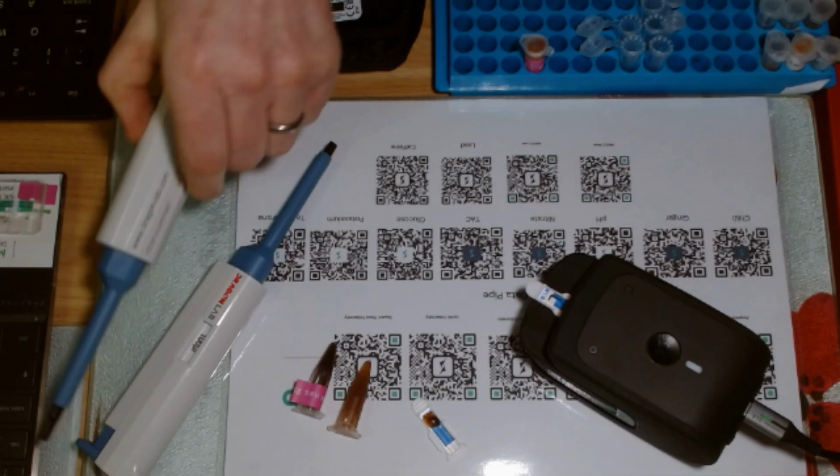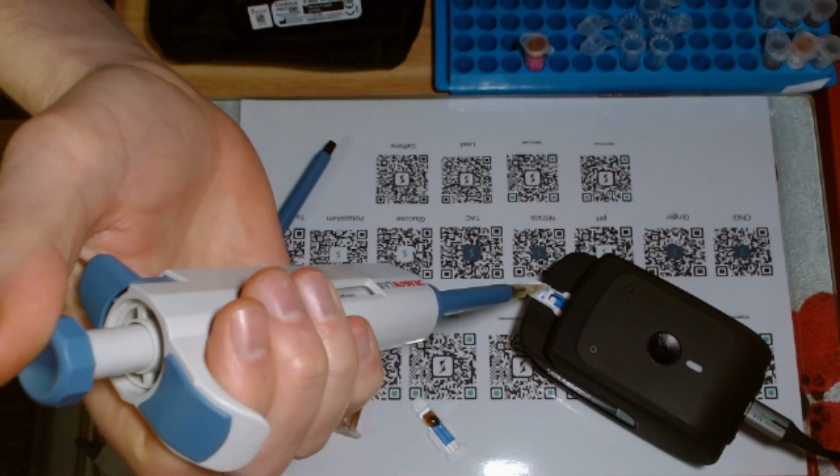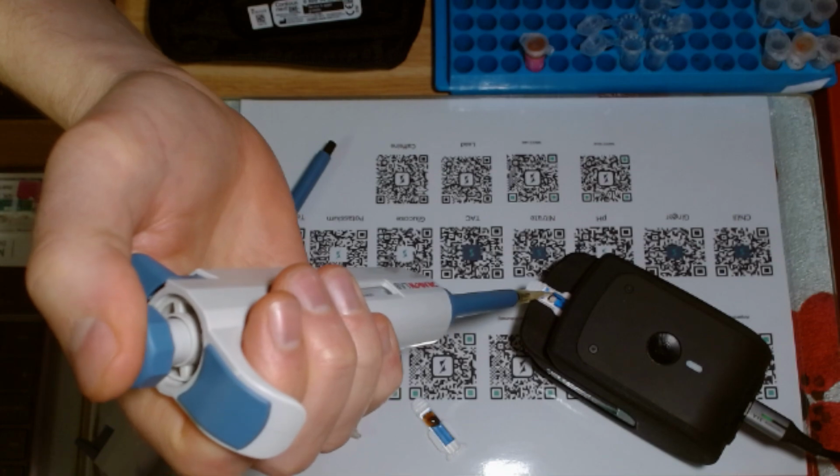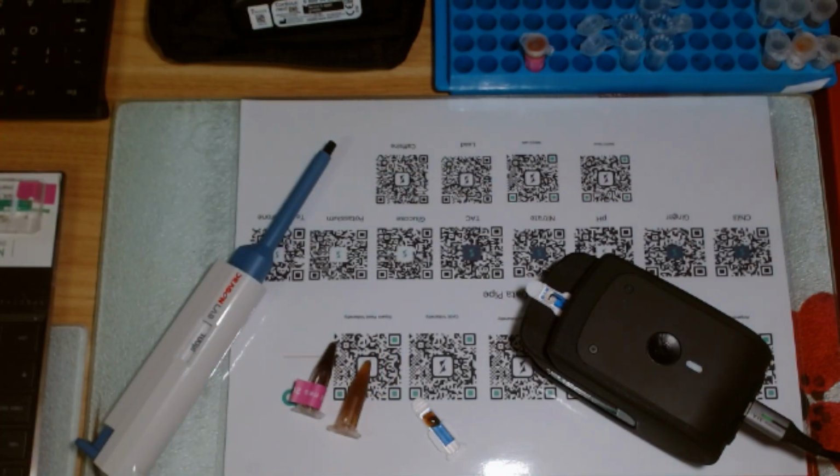Let me grab a chili sample, which I am doing. I realize I need a clean pipette, and I will put the sample onto the sensor. Now, what I'm going to make a point of doing is making sure that one of the questions was covering this part of the sensor here. It's 50 microliters.